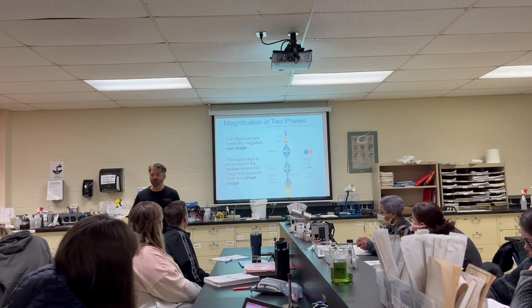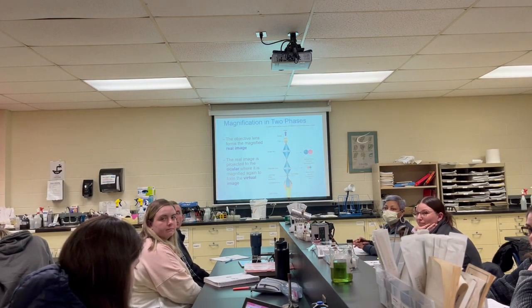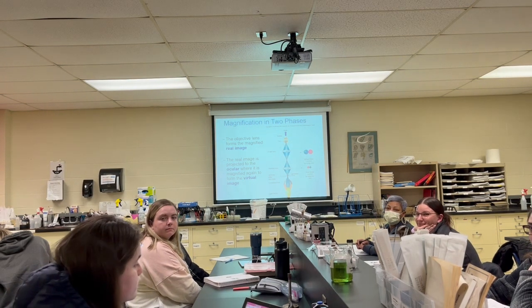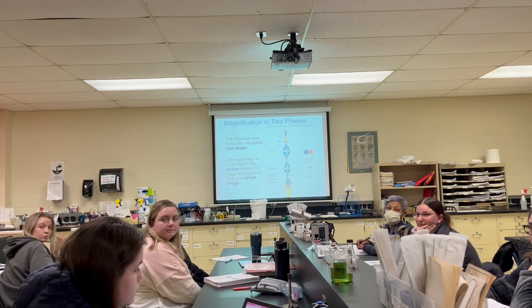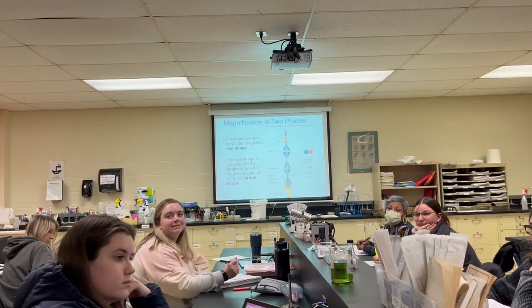By the way, before I forget, for anyone who has false eyelashes in here, these are called demodex. They love to live in your eyelashes, and they love to eat the glue that holds your eyelashes on. I bring that up because if you go to use a microscope, there are alcohol wipes. Please wipe the ocular off.